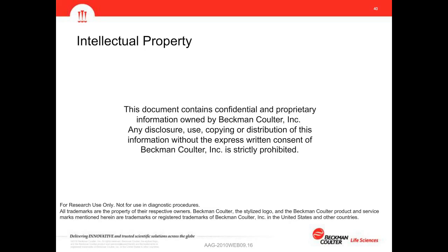So the way our software works is that you would browse to an input file that you would be using today that identifies the library we're working with today, or the samples that are being processed. Maybe they're being mailed in, maybe they're being fed over to you from another group. But however that information is brought to you, you'll start with a plate or with a rack of tubes, and you'll start with some sort of input file that gives you information about them. And so we'll attach that in the beginning, and that's why we talked about the identity portion of the data workflow. It's at the start of the process.